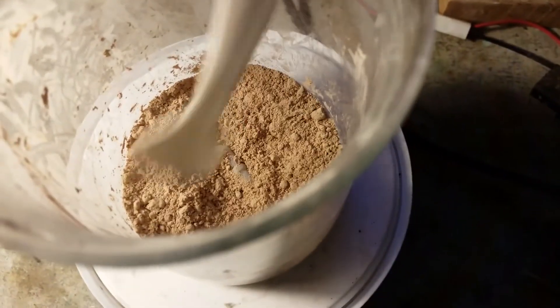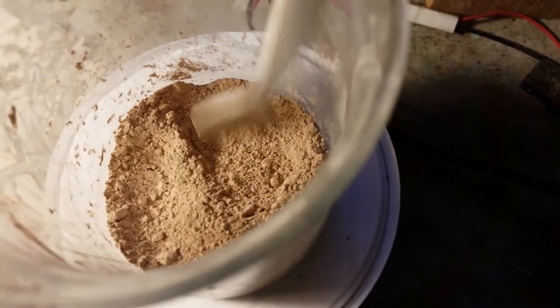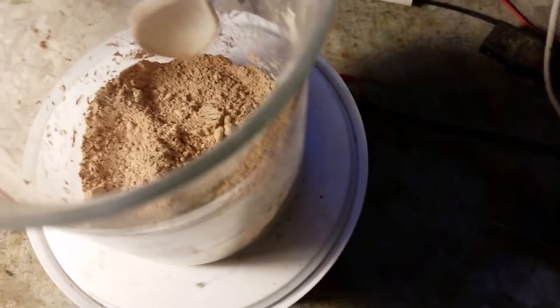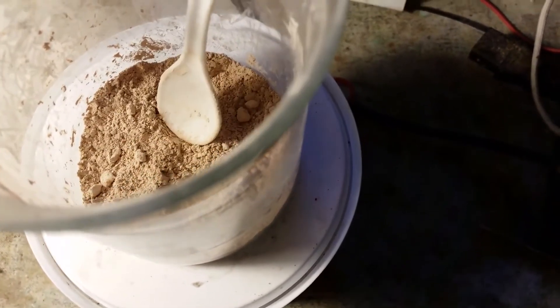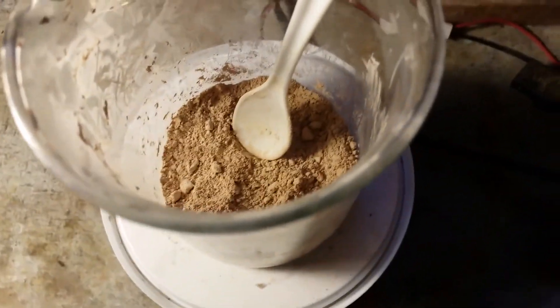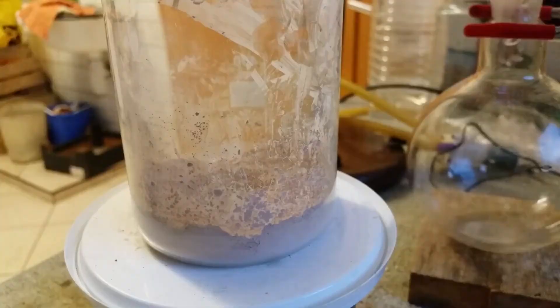The product — this intermediate — is kind of brown, which is not ideal. I would like it to be white or maybe pale pink, but it's brown and that's slightly concerning, but I will just move on.